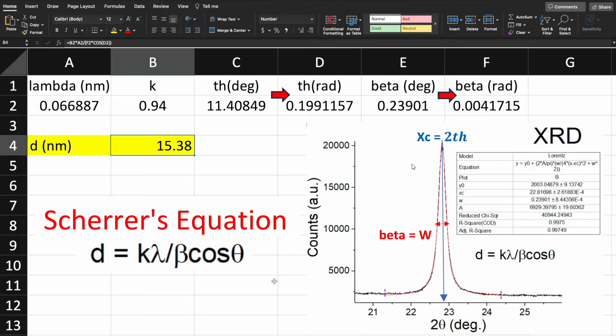In this video I will show you how to calculate grain size using the Scherrer equation. The formula is: grain size equals the Scherrer constant times the wavelength of x-ray divided by beta, which is the full width half maxima, times cos theta, where theta is half of the peak center.